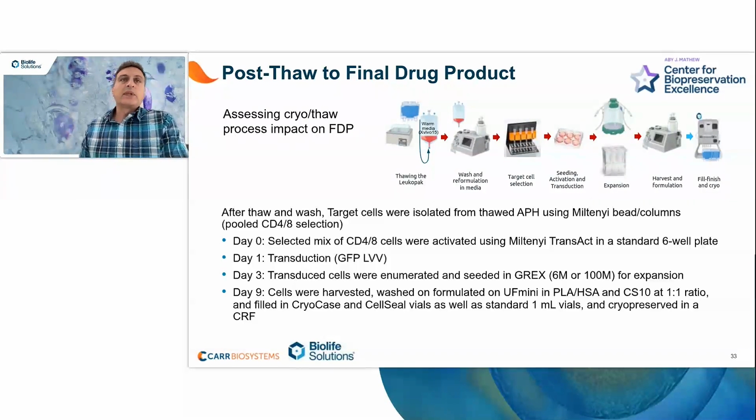time of seeding. On day 1, the transduction step was done using a GFP lentivirus. The purpose of this was to assess whether the uptake and integration of lentivirus was affected by the cryopreservation method, by the wash method, and by the cryopreservation itself versus the fresh product. Would we have the same level of transduction in the cryopreserved cells versus fresh product?